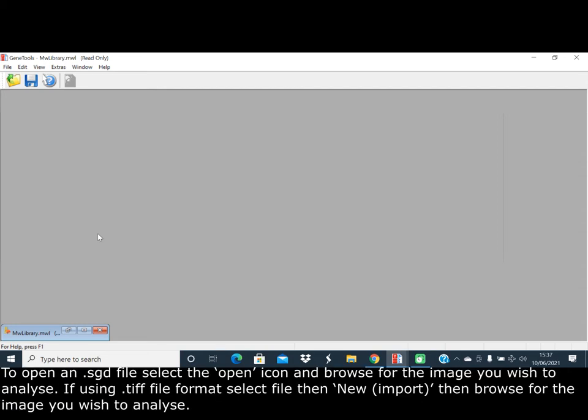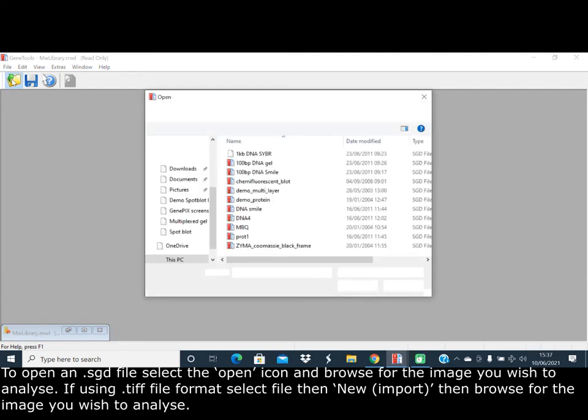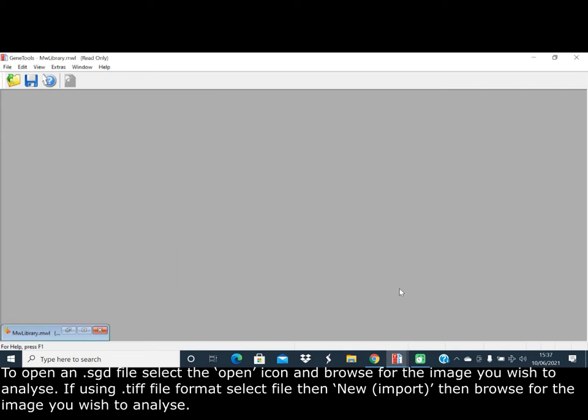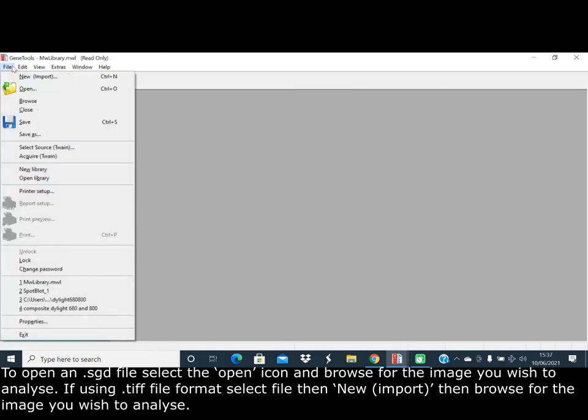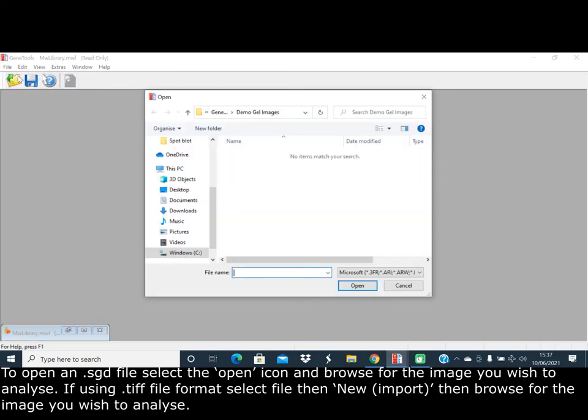To open an SGD file, select the open icon and browse for the image you wish to analyze. If using the TIFF file format, select File, New, Import, and browse for the image you wish to analyze.